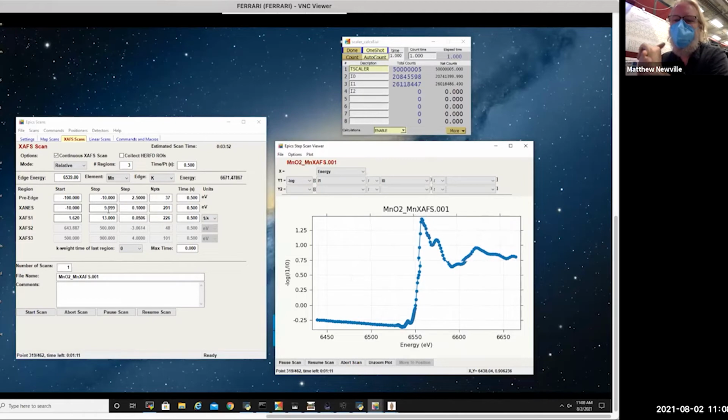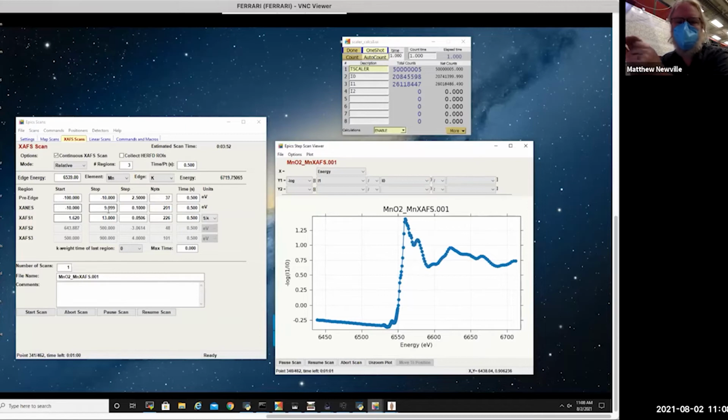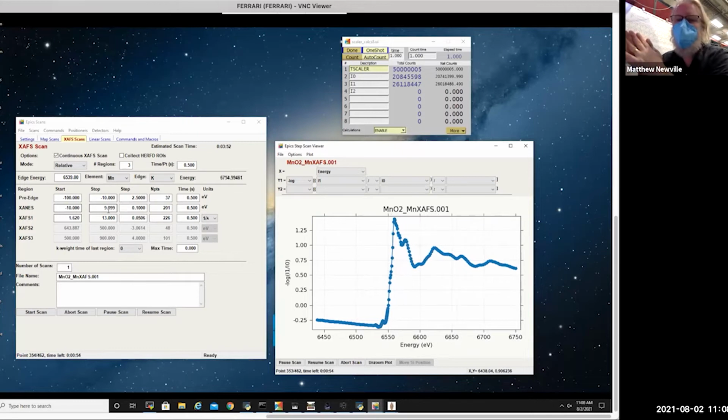Let's see. When it comes to your knowledge of when pre-edge peaks begin, do you remember the eV values from experience, or is there a database? I think there's not really a great database of what the absolute edge energies are for the pre-edge peaks. And I sort of don't remember them all. I just recognize many of them.